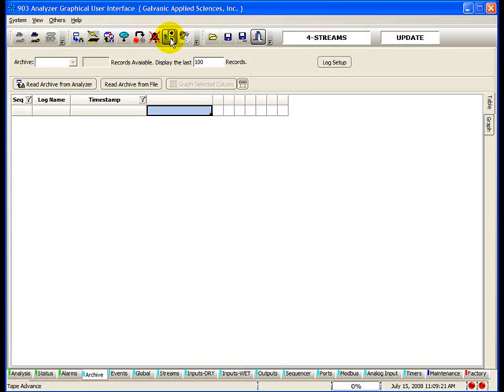Tape Advance forces the analyzer to run the motor and perform a calibration of the sensor block. Pressing this button is equivalent of cycling the power to the analyzer. The Upgrade Firmware button updates the analyzer with the latest firmware.